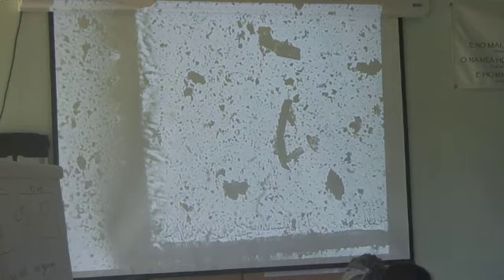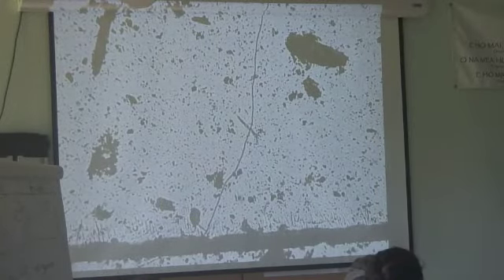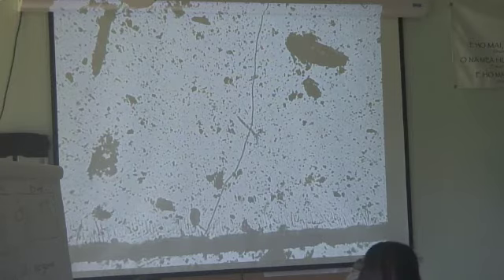So, we're looking for nematodes, first of all. Isn't that interesting? I wonder what that is. Hopefully we'll go back and look at it. Ooh, that looks good. That nice long strand like this. Ooh, I think we might have some good fungi in here. But we're looking for nematodes. See how easily distracted I am? That looks pretty interesting, too.